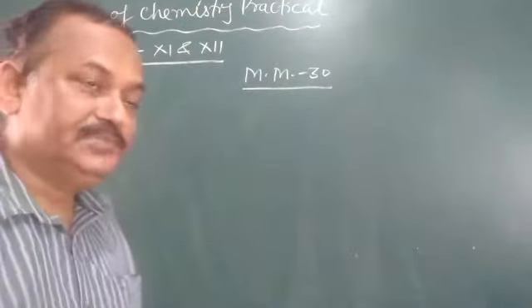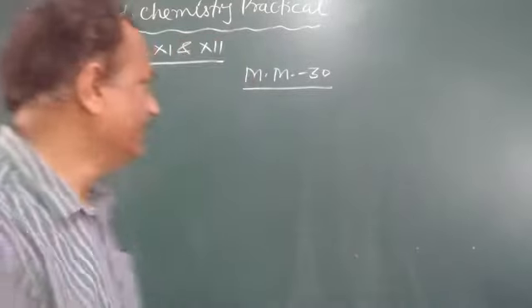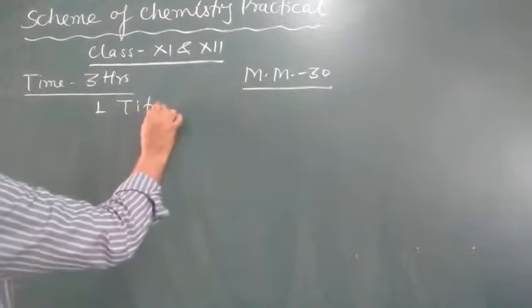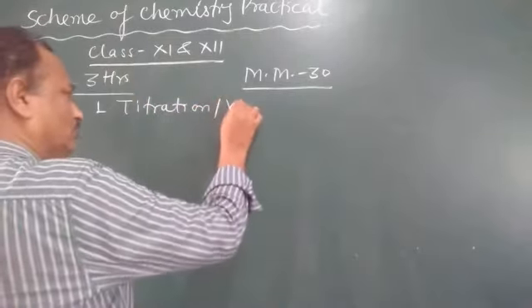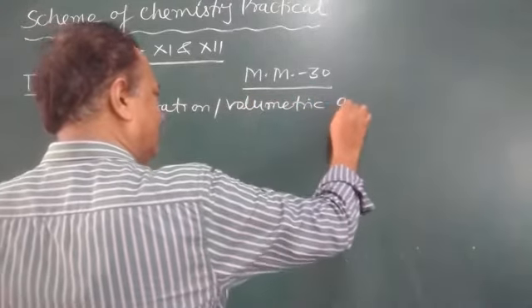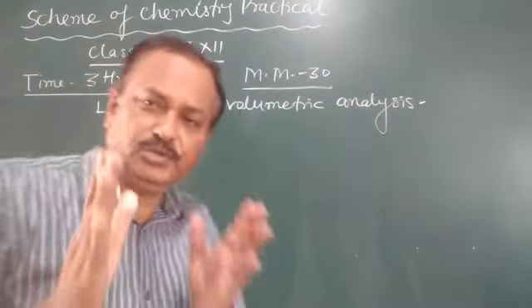Now in the 3 hours time, children, you have to perform 3 experiments. The first experiment is titration, and it is also called volumetric analysis.